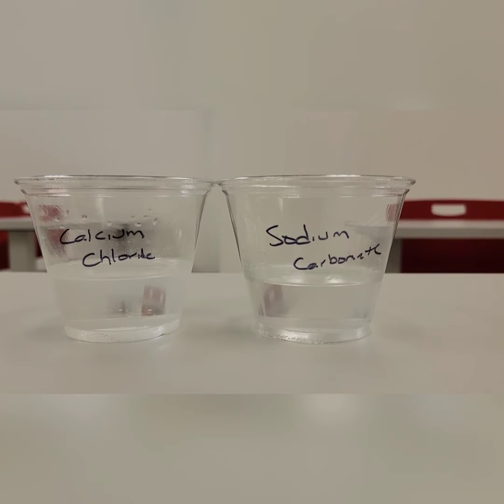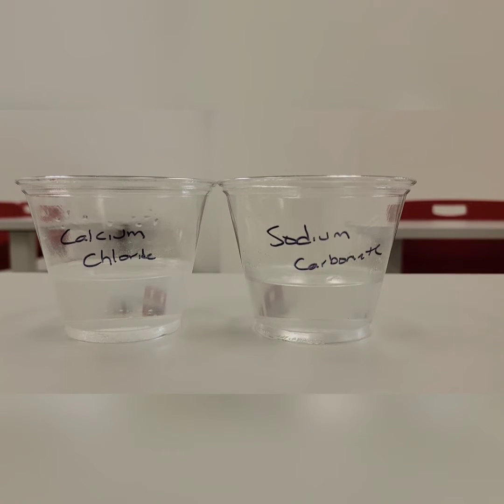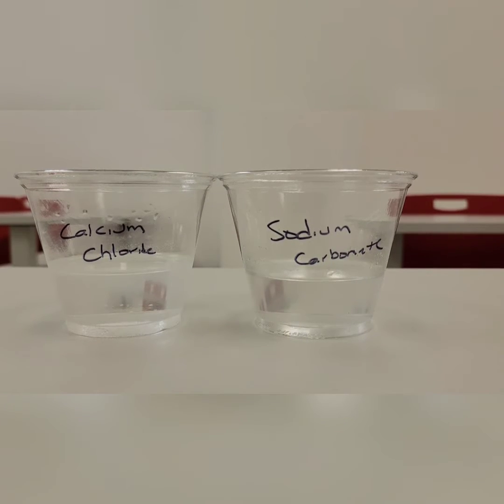Hello scientists. Today we are going to be investigating changes in substances. So as you can see, we have our two substances, calcium chloride and sodium carbonate. I am just going to observe both substances so I can make note of their properties.